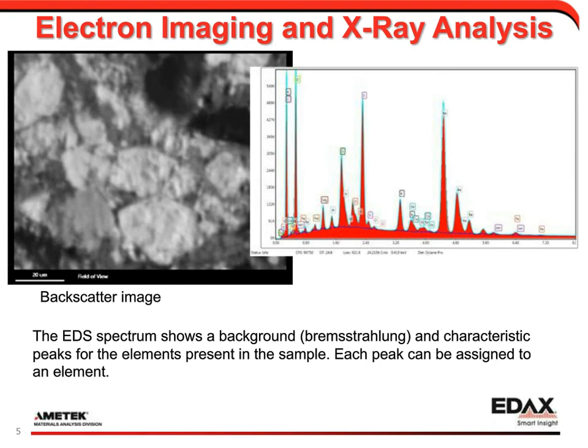We can see in the low energy range, we have a couple of strong peaks from carbon and oxygen. We have some silicon and sulfur as we move up, and just a little above the middle, we have barium, where you can see we have 3 peaks from different transitions in barium.